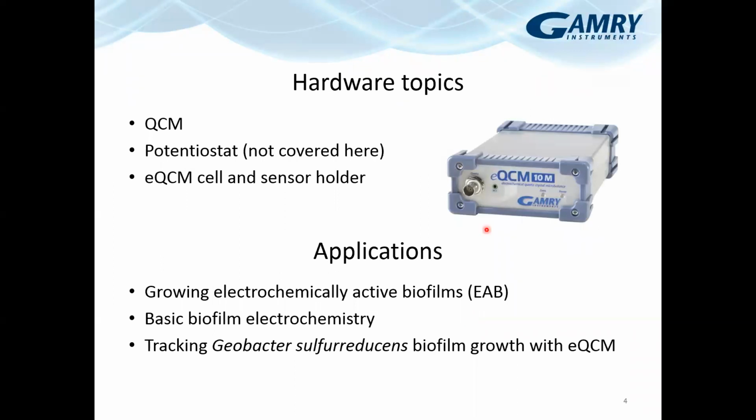Pictured here is the actual resonator device, the EQCM 10M. That's what I've used in the past, and this is what I used for all the results that I'm going to show later. And I'm going to describe how this QCM works from a basic approach in terms of equivalent circuits.